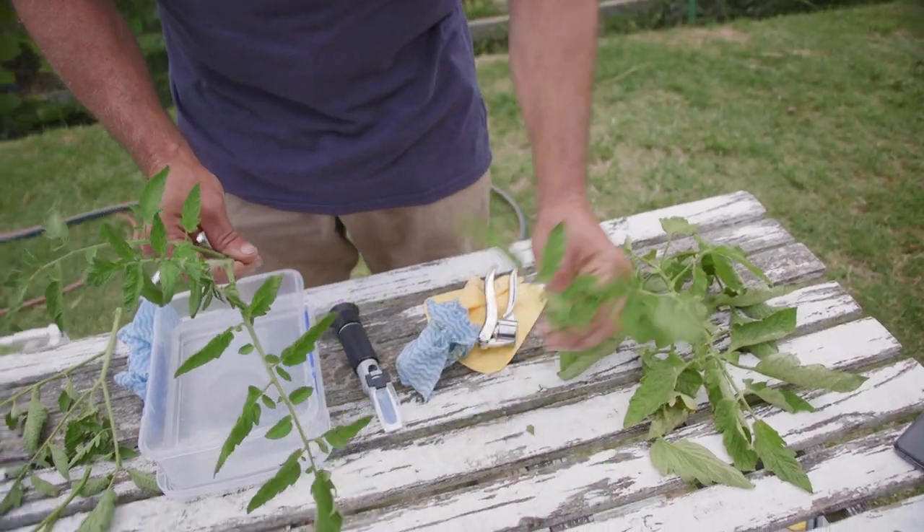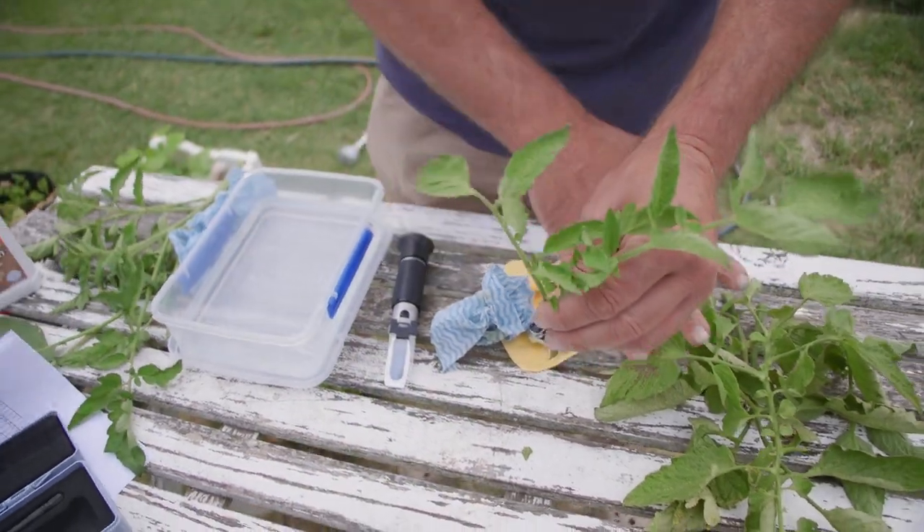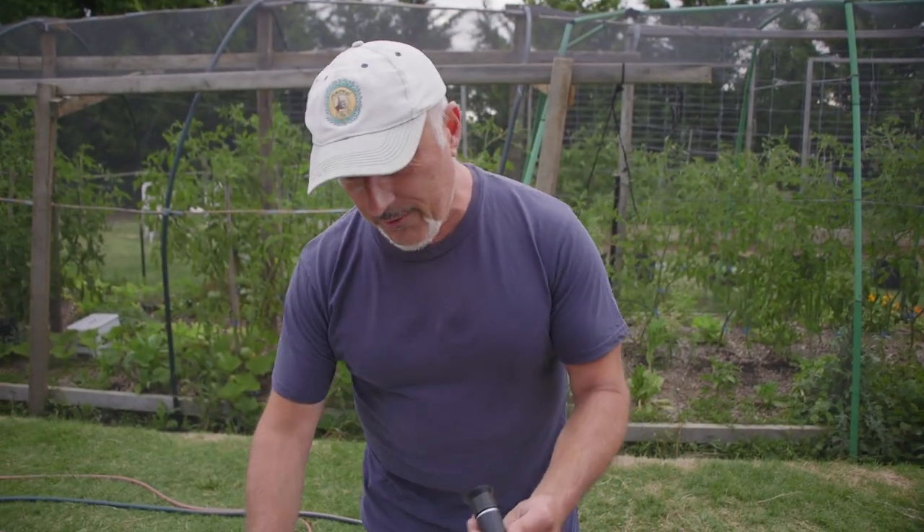Now we're going to test - this is the stem of it so that's the best part, which is the new growth. That's not bad but the bottom leaves aren't doing too well. We're going to test this in the refractometer.